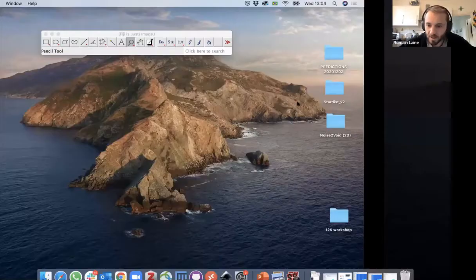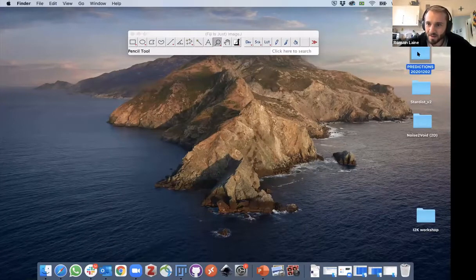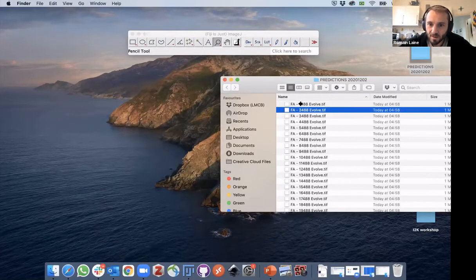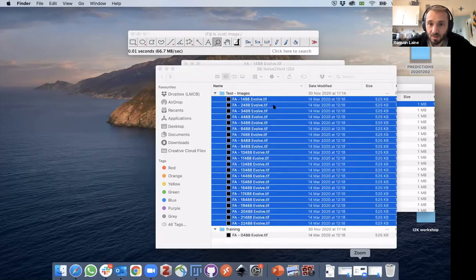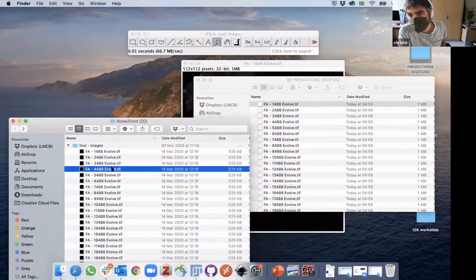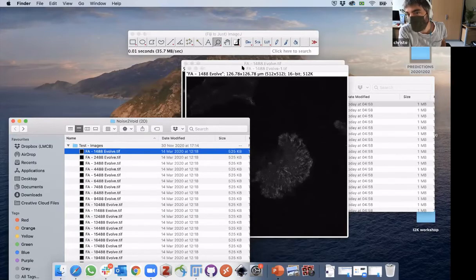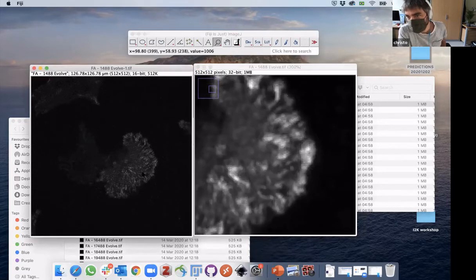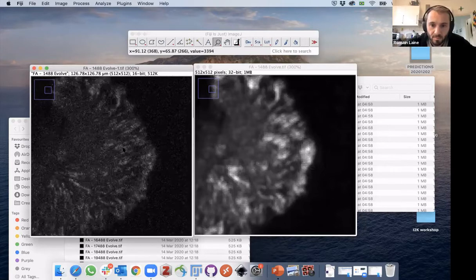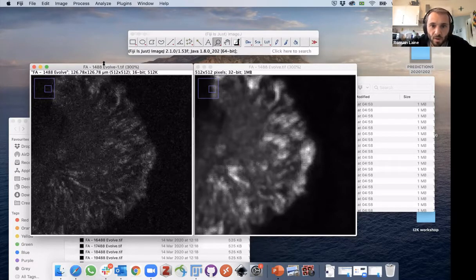Absolutely. If I open just one of them, you can actually see that yes, it has smoothed it a little bit. So of course there is an element of smoothing. If, for example, you do an unsharp masking with a 1 pixel size on a typical noisy image, you will retrieve some details that are not noise, and that is the kind of detail that disappears here. Yeah, that's absolutely true. That's a very good point. So nothing's perfect.